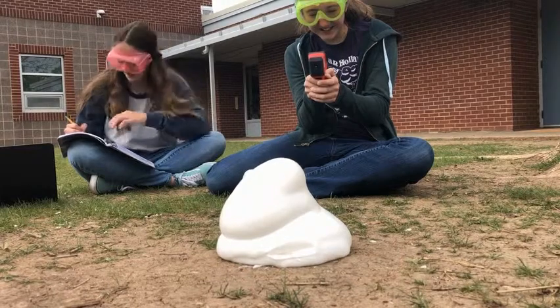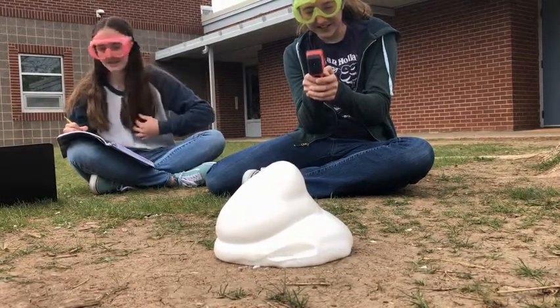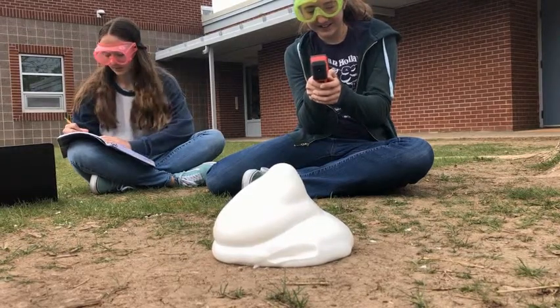We can tell this was a chemical reaction because there were bubbles, which means gas was released. There was also a transfer of energy, which is also a sign of a chemical reaction.